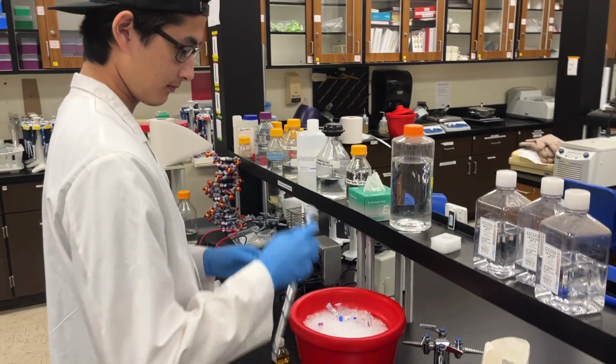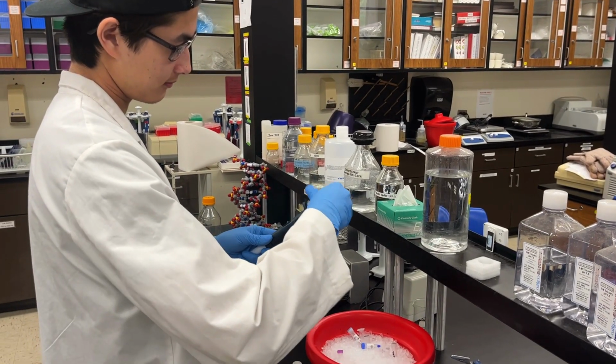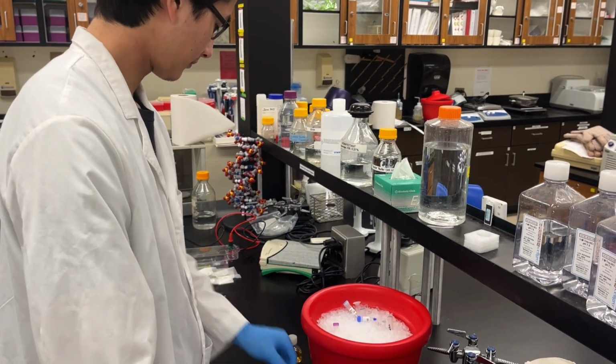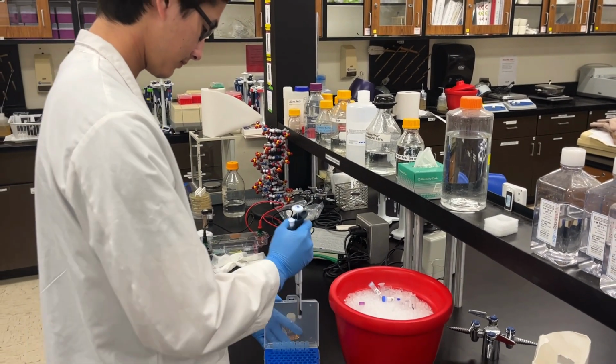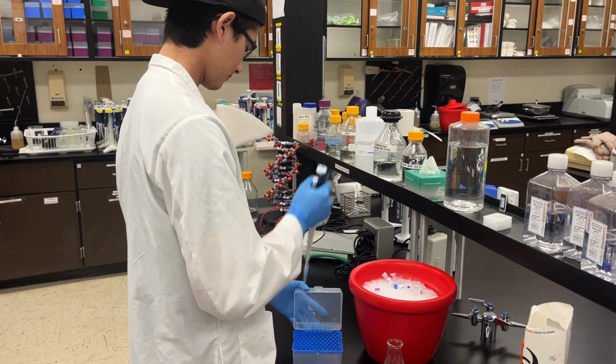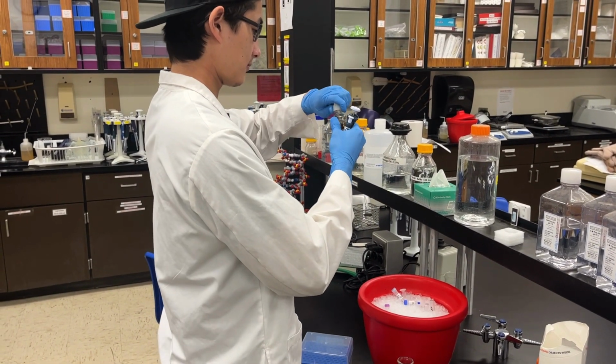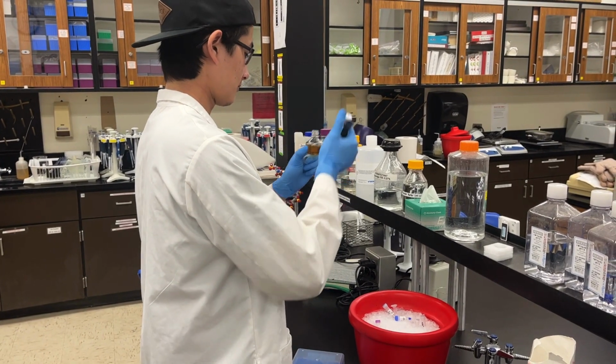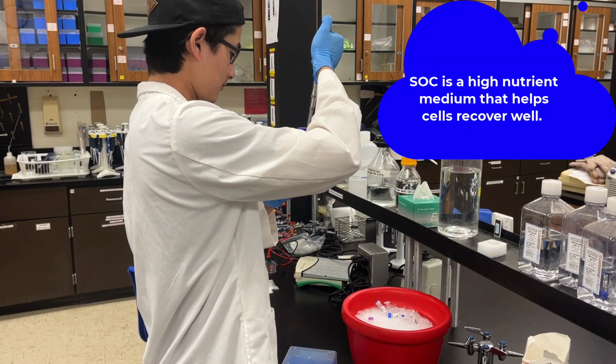However, they're still quite weak. So this next step, which is called the outgrowth step, allows the cells to grow for 1 generation. This allows them to fix their cell walls, copy their DNA one time, and just be ready and more robust to actually resist the antibiotic. To do this, Jaden will add some SOC medium that he let thaw.